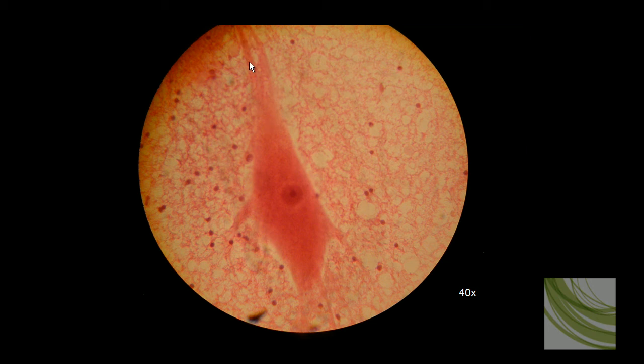This almost looks like an axon from another cell body. This will be several dendrites. And that wraps up this slide.